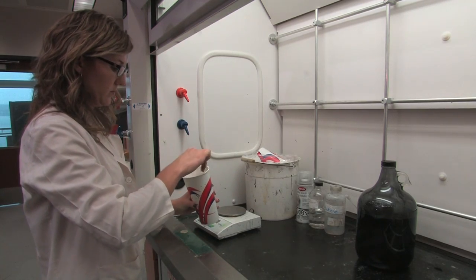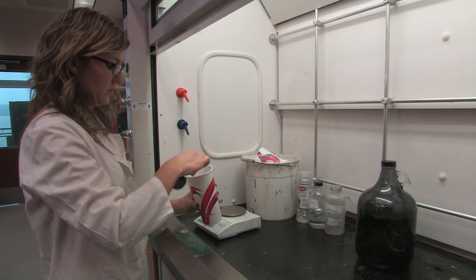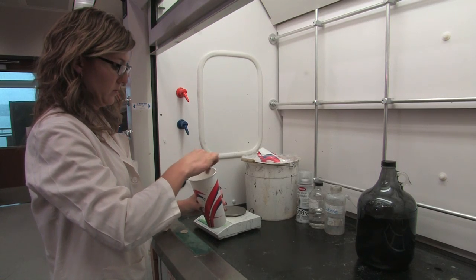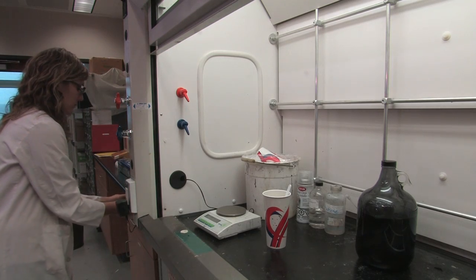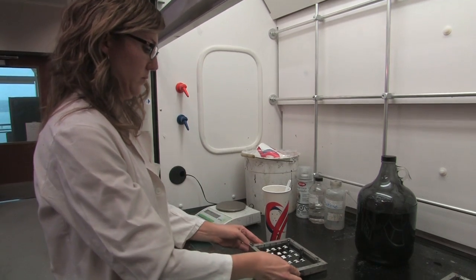Tare the scale again and then apply 1.4 grams of hardener with a disposable pipette. Stir the epoxy again with a spoon, make sure it is evenly distributed and then we're going to pour the top coat over the otoliths that we placed on the lines in our tray.